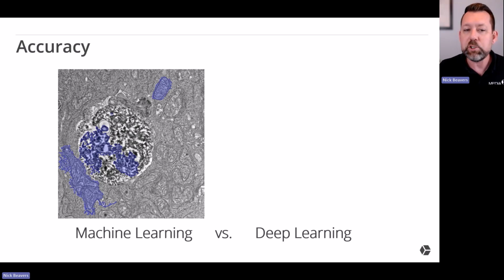Let's give an example of a machine learning based approach to something that looks like this. You have low contrast, a really challenging image where we're looking for mitochondria. The mitochondria are these very oddly shaped circular or non-circular patterns in this image with a bit of a zebra stripe in them, if you will. I'm not being very technical, just trying to give you a sense of what you're looking for. You can tell it's actually found a lot of the chromatin in the nucleus. That's not what they were looking for. And this one is just completely wrong.